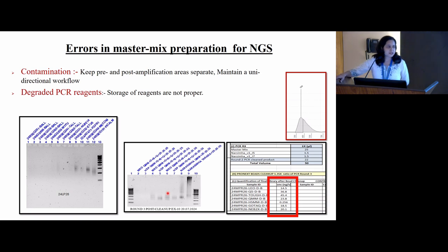because every time you put anything into your service, it is necessary to make a backup plan for it also. If something is not working, you have to be ready with alternatives. So at the time of standardization and validation, it is better to go with that. Here we had checked with different master mixes and different cycles, because in NGS it is not only that you have to do amplification. Amplification comes after WGS and so on, if you are not working with amplicon libraries. So in that case also we can get the results here.